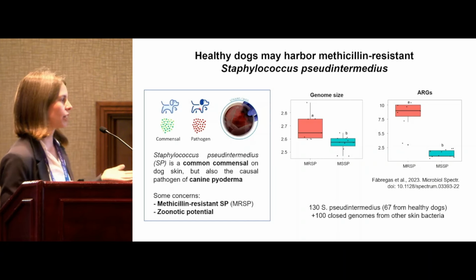So the first thing is getting these long reads. Then the idea is to get the metagenome-assembled genomes, or MAGs. The good thing about using long reads is that you can get these super nice single-contig MAGs, which is great. But of course, not all of them are single-contig MAGs, which is the ideal thing that you can have. In the metagenome, you also have very long contigs that you still need to assemble further.